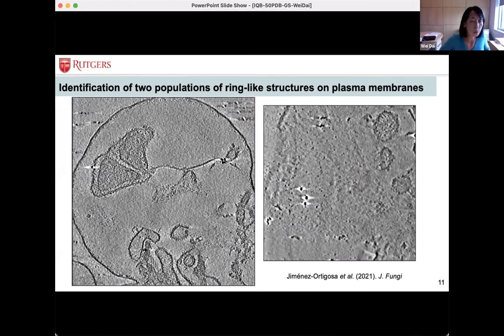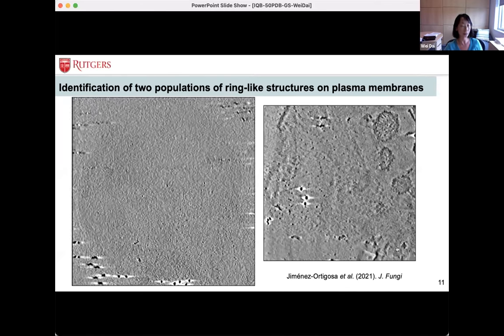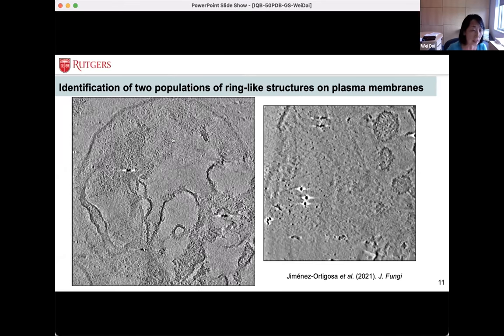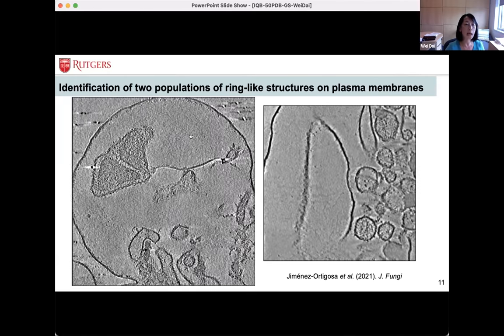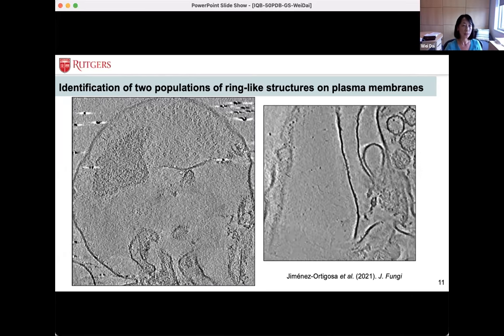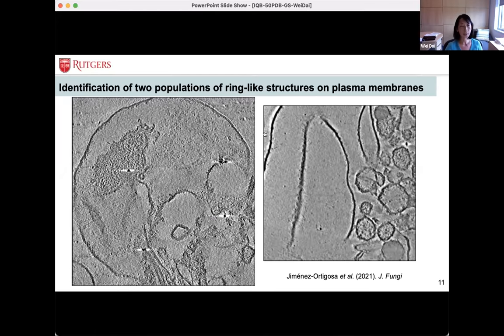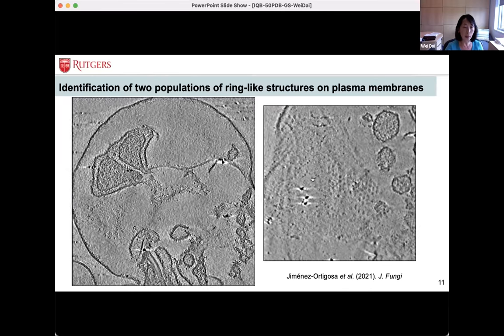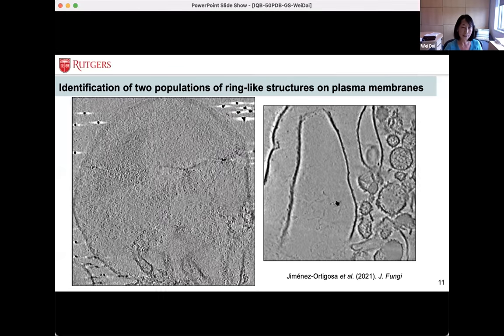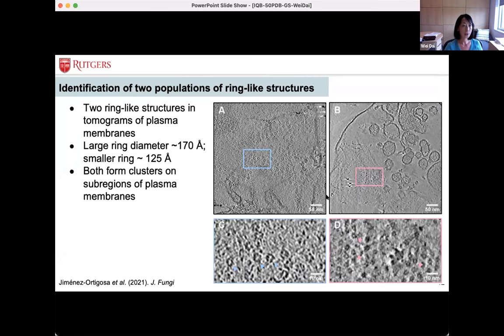Here I'm showing you two tomograms reconstructed from tilt series. The most obvious or abundant structure we can identify on those tomograms is a ring-like structure with a diameter of about 170 angstroms. Those ring-like structures seem to form clusters across big regions of the membrane. The second structure we can identify from tomograms is a smaller ring-like structure about 125 angstroms in diameter. They also form clusters across the membrane. Here I'm showing the section view of the two tomograms so that you can clearly compare the morphology and sizes of the two ring-like structures.